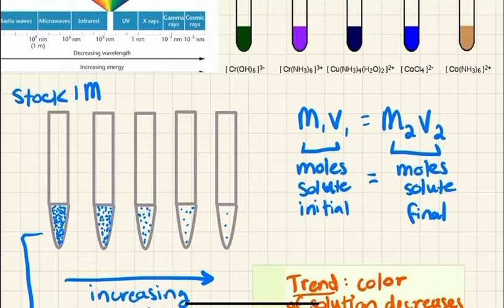So in the lab, you will pretty much every week be using solutions. And this is because a lot of reactions take place most efficiently when there is a solvent present and so on. Solutions are very convenient for chemistry to occur. But whatever you find in the fume hood, we'll typically call it the stock solution. And the stock solution will have a specific concentration associated with it.